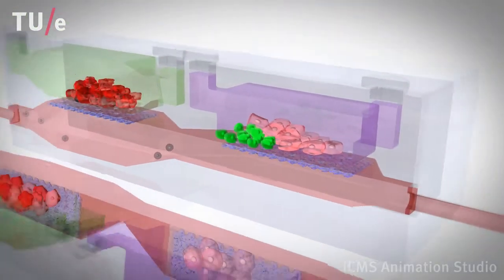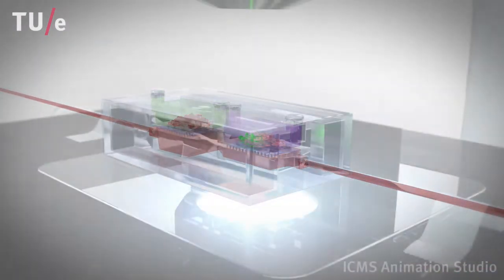The cancer chip allows us to observe this whole process in real time through optical microscopy.